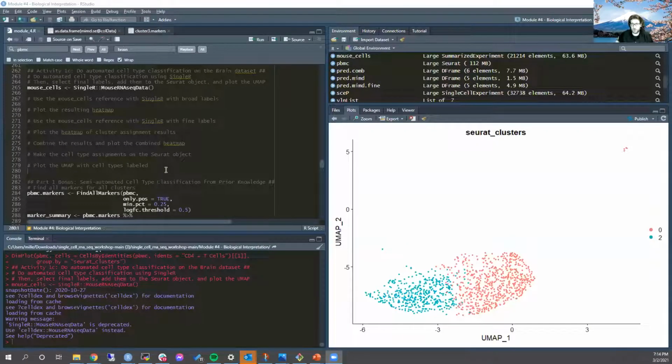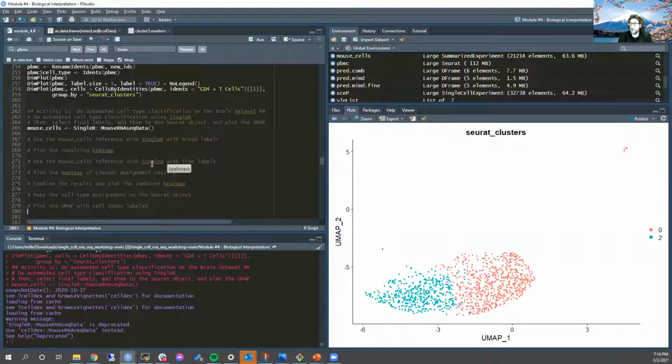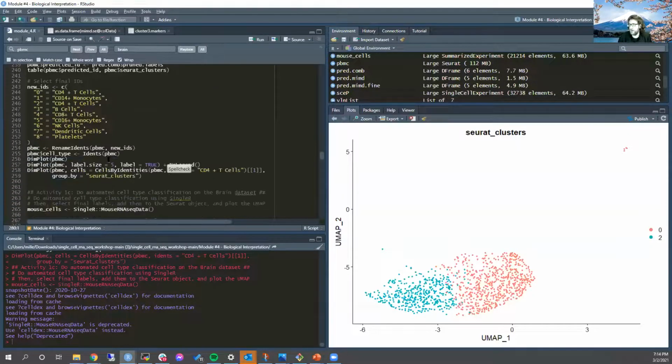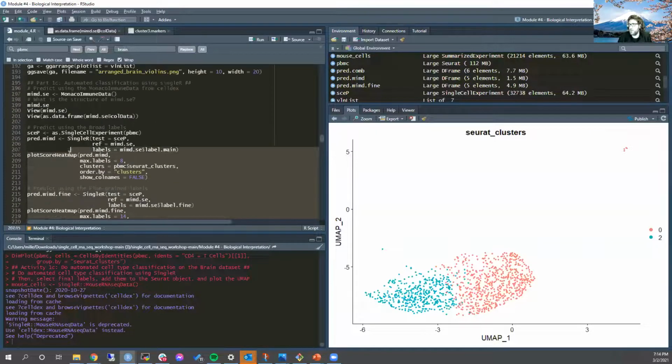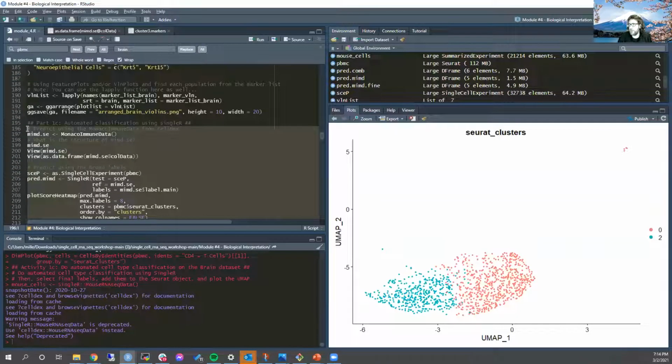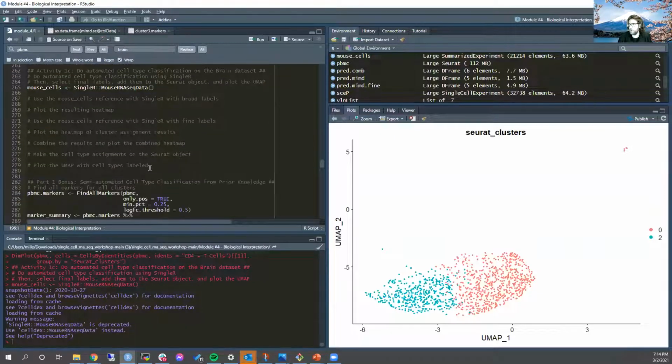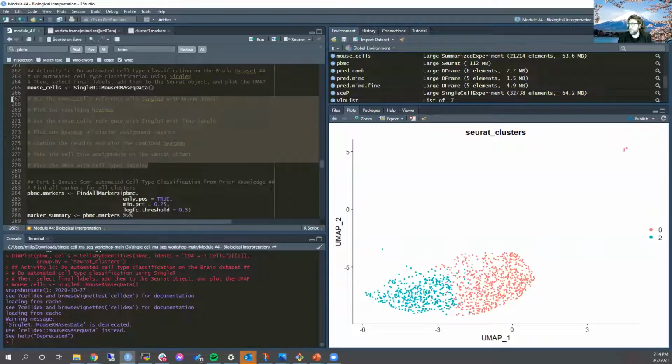All right, so I'm just going to go ahead and share how I would do this then. Again, there's really no right answer, and this is definitely the hardest thing we've talked about so far. This is the least trivial part of single cell, the biological interpretation. So this is not easy at all. If this felt difficult, it's because it is. That is why I tell you to copy and paste whenever you can, because single cell is hard. You shouldn't make more work for yourself without a good reason.